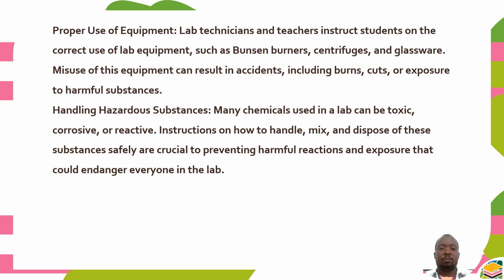Now, proper use of equipment. Lab technicians and teachers instruct students on the correct use of lab equipment such as Bunsen burners, centrifuges, and glassware. Misuse of this equipment can result in accidents, including burns, cuts, or exposure to harmful substances.